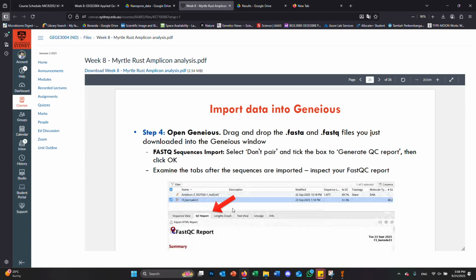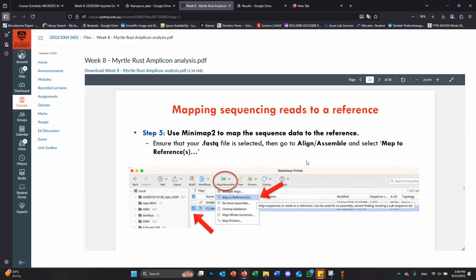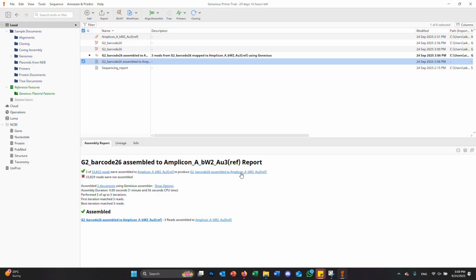It creates a pairwise alignment: it takes your reference sequence and your consensus sequence, matches them up, and creates an alignment. Scroll along, have a look, zoom in and out. What does your alignment look like? You can see some stats on the left-hand side if you want to open up some of these. There's one that says percentages. It gives you the pairwise identity. You can see if there are any gaps, that sort of thing.